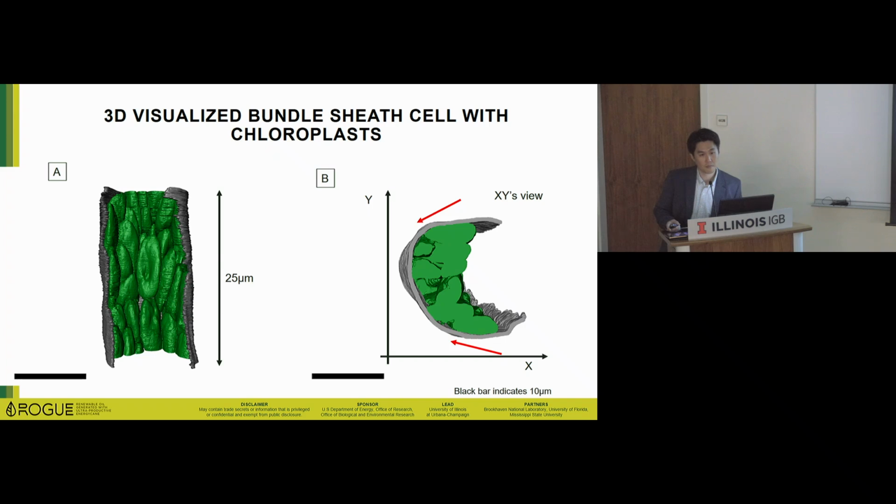I'm not a microscopy researcher, but we have a microscopy method, and it's also a good idea to try cell counting by flow cytometry, and also DNA. We were trying to compare between methods.